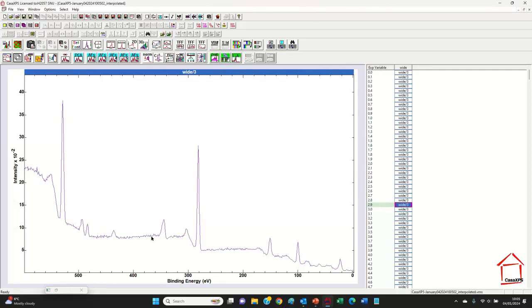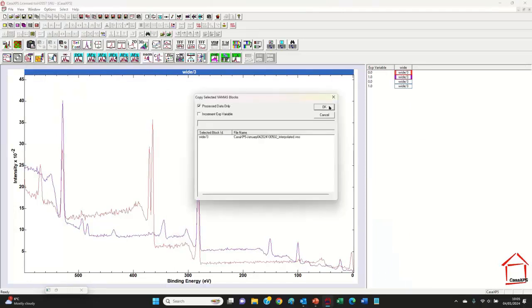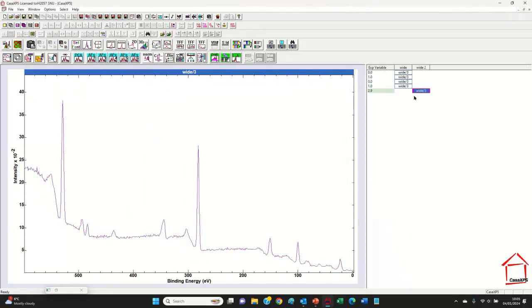If you look here, whereas initially there's a little evidence of silver, by subtracting off a little bit of the silver spectrum, I've ended up with a background instead of signal that might be associated with silver. So that's the first problem, is to produce a spectrum that is glass and no silver. So let's copy that into the construction file.